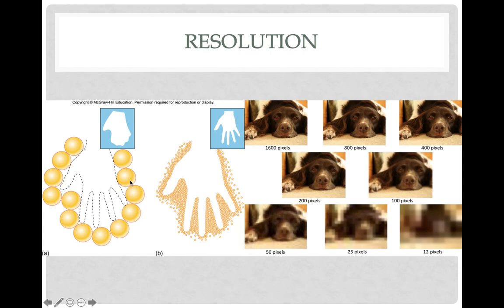So resolution is the ability to do this. This has much better resolution than this. Even if you might be looking at them, as you can see, at the same magnification, there's no difference in the size here. They look different when you take the picture up here because of the ability to resolve. This has a much lower resolution power than this does. Microscopes work the same way.